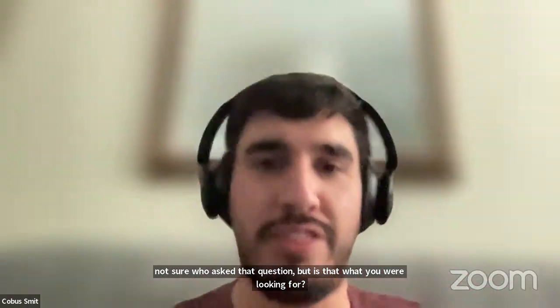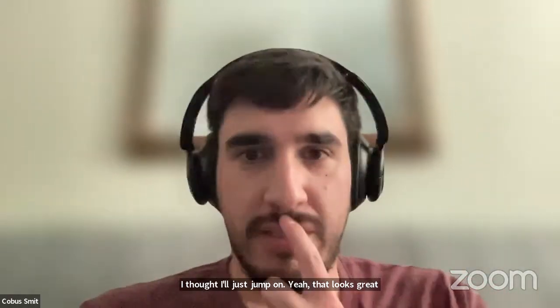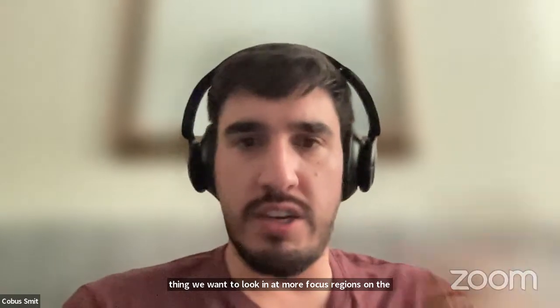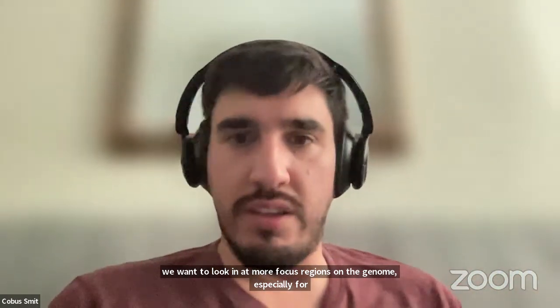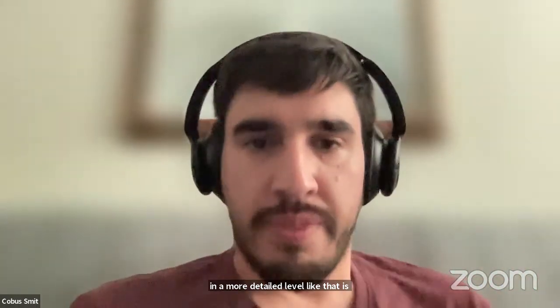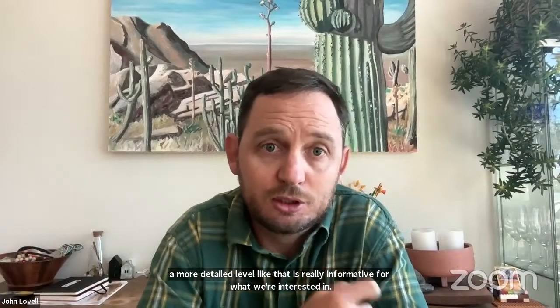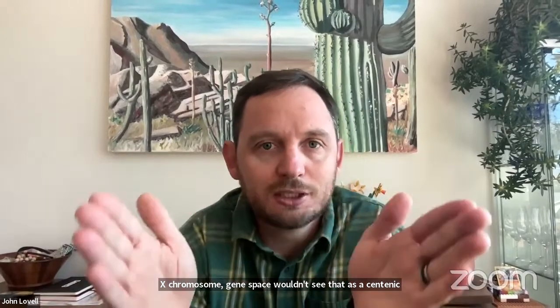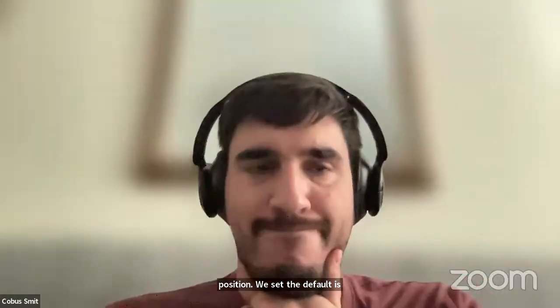Hi, I thought I'll just jump on. Yeah, that looks great. It's always a thing we want to look at, more focused regions on the genome, especially if a gene is moved in and out of a region. So being able to look at the microsynteny in a more detailed level like that is really informative for what we're interested in. The issue with the microsynteny, though, if one gene is moving in or out, GENESPACE really wouldn't see that as a syntenic position. We set the default to have 5 genes in its syntenic block to be retained.